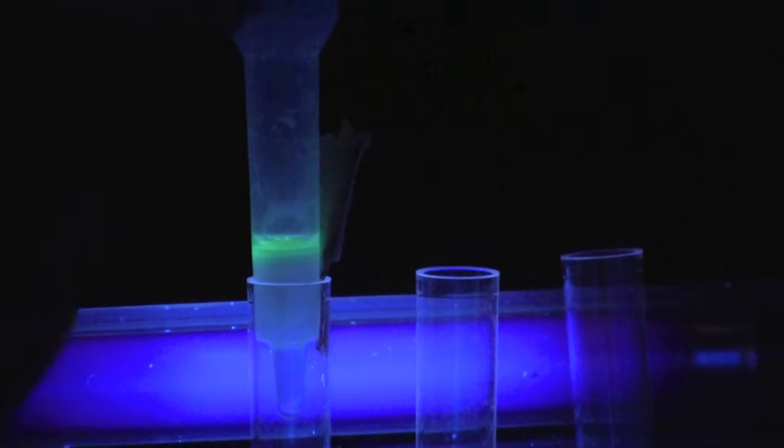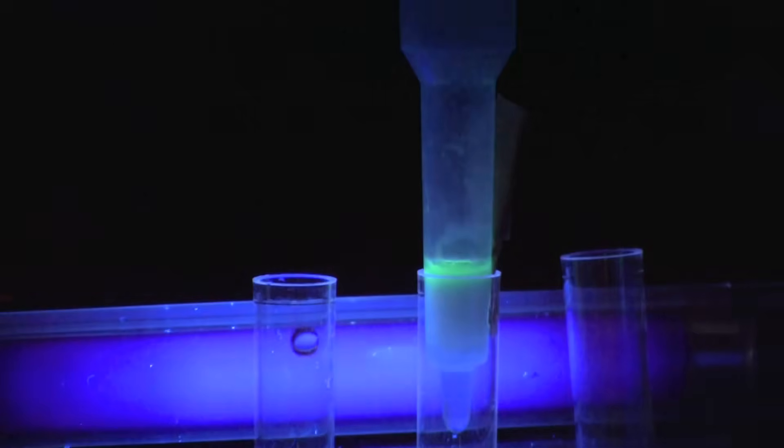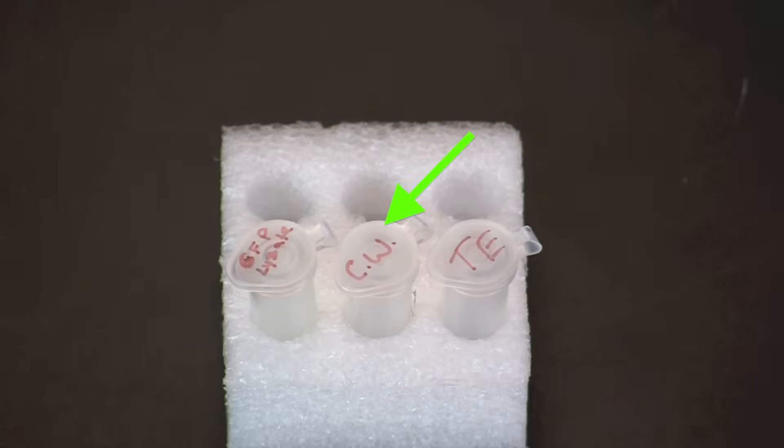Transfer the column to collection tube number two. The remainder of this activity can be performed in a darkened room with a handheld UV light to increase the visibility of the GFP. Allow the lysate to enter the column bed until the meniscus is within one to two millimeters of the surface of the resin.